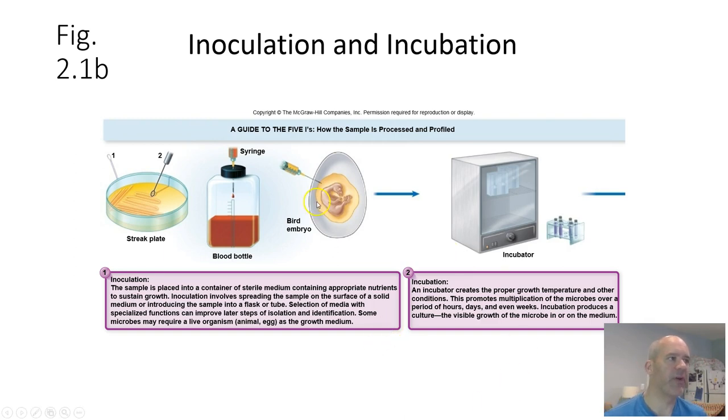Okay, so here's a figure from your book. This is showing you those first two I's, inoculation and incubation. I just talked a little bit about this, but there are different ways that you can do inoculations in the laboratory. This is where you're taking microorganisms and putting them into some sort of substance that will allow them to grow.